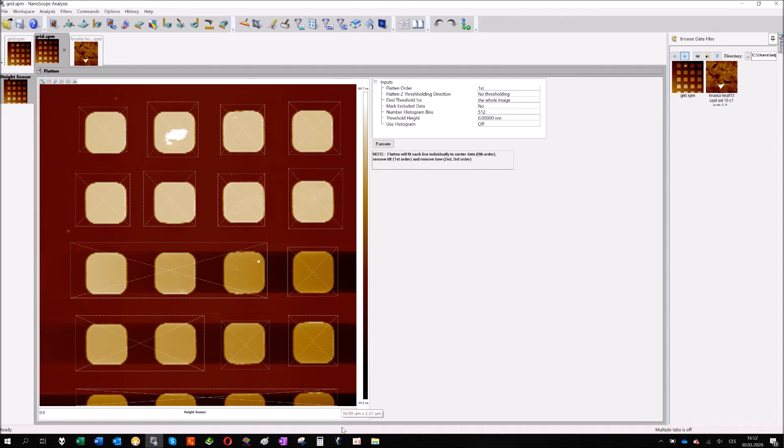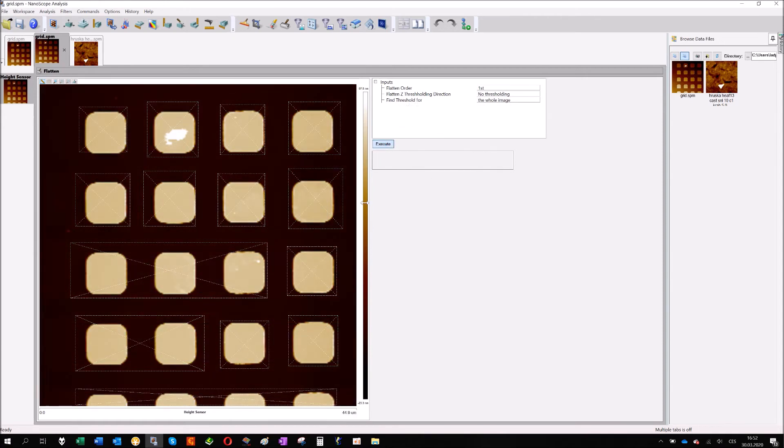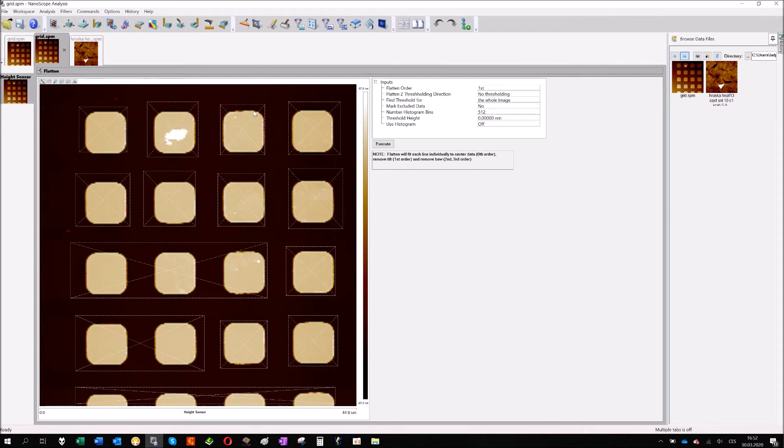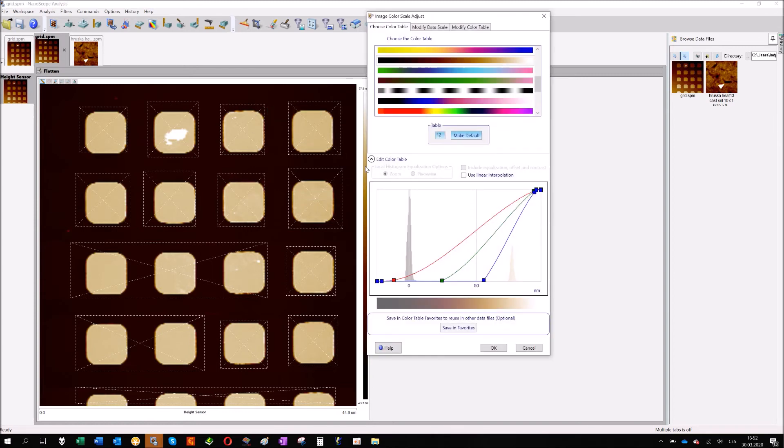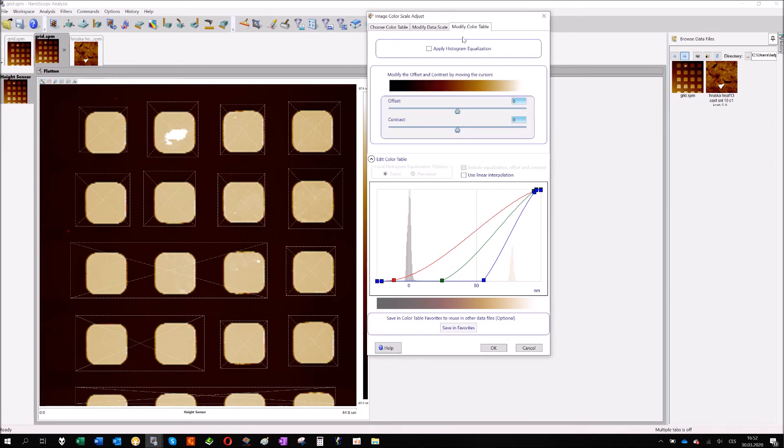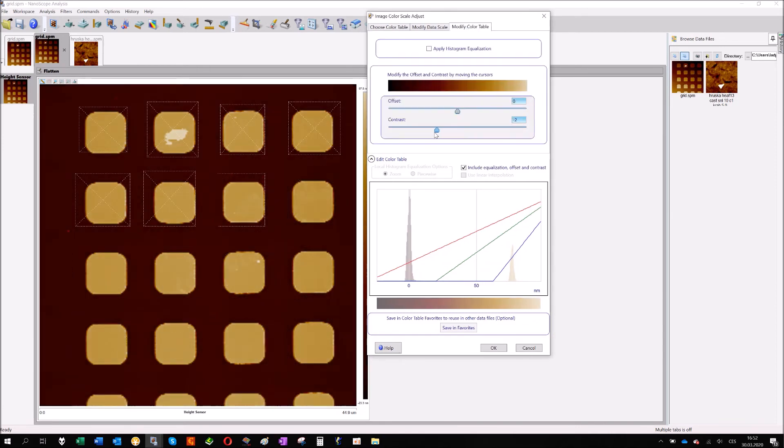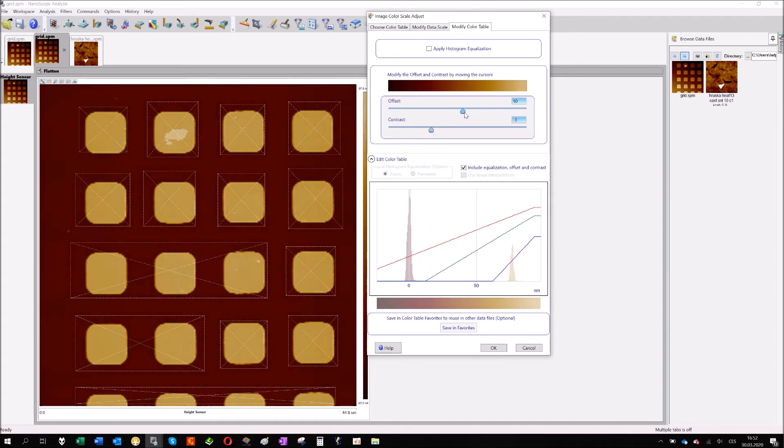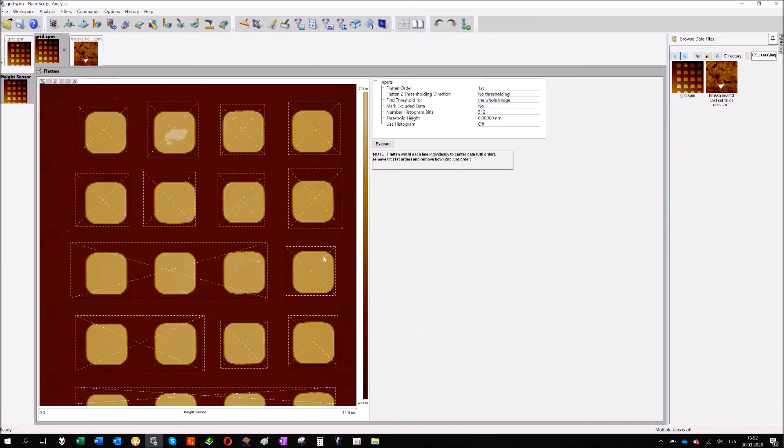If it's possible, like in this case, just mark all the specific very high or very deep features on your image, exclude it from the calculation and click execute. It will just change the z-scale, so I will just manually change some offset and contrast. And that's it. We flattened the sample and we have here the substrate with some features on it.